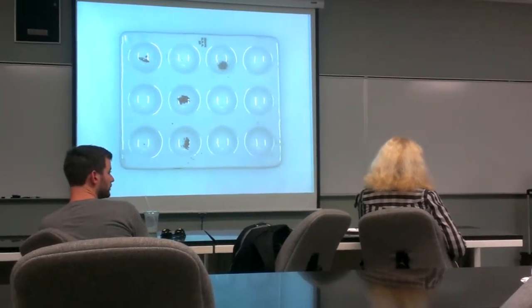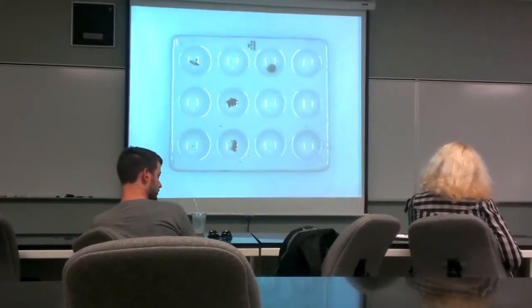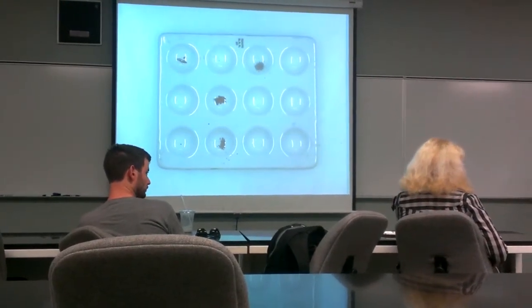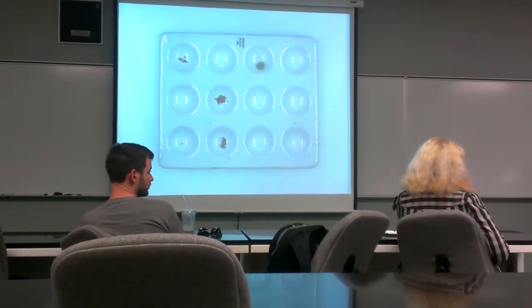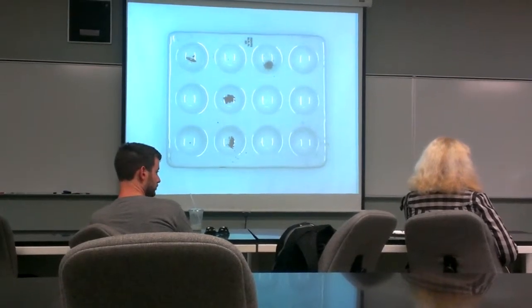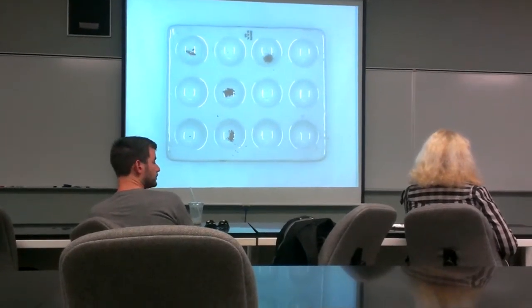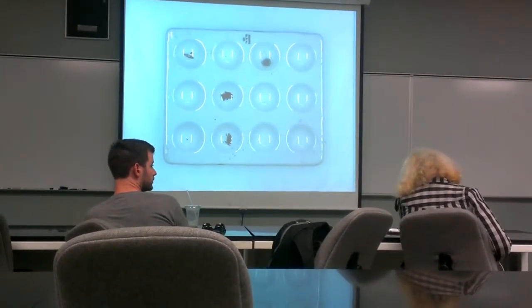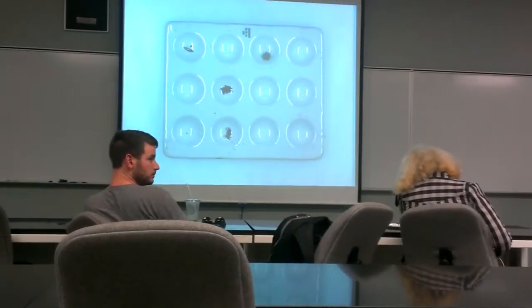It's testing for nickel because iron meteorites, all of them have nickel. In fact, 99% of meteorites have nickel, including iron stones or stony iron. So that's a sure test. So what we do is we test for nickel using a qualitative test called dimethylglyoxime. Same thing I've done with yours, Dave. I don't want to just check them out.